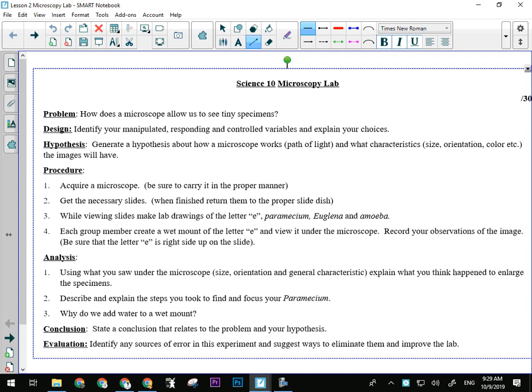Now, things that can affect how a microscope works need to be controlled each time I look at a new specimen, hoping that it will look a certain way because it's being magnified by the microscope. Those certain things are usually going to be light related. They are not really going to be environmental. A microscope will work whether it's 30 degrees or minus 30 degrees. The knobs won't turn as well, but the whole light focusing part will work just exactly the same. So you don't have to put in temperature as a controlled variable.